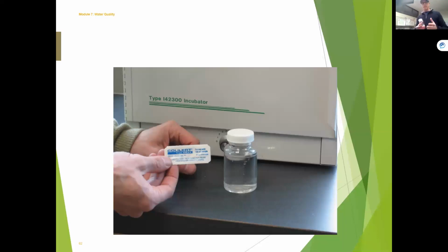So really, really important, wash your hands first, right? Keep your hands washed. What you're going to end up doing is you come to your sample and turn on your sample port. I recommend something like a 1/4 inch copper that's going to give you a nice flow. I don't want the water spitting all over the place. It should look like the width of a pencil coming out of the tap. It should be nice and uniform, and they call that a laminar flow.